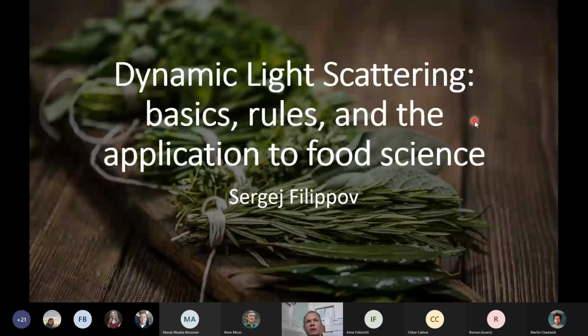So in my work, I'm using a lot of physical instruments like dynamic light scattering, small angle X-ray, neutron scattering, zeta potential, electrophoretic mobility experiments, just to study polymers, any type of polymers, polymers for drug delivery, polymers in food science. And today I will be talking about one of such techniques.